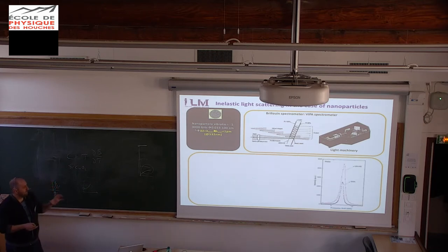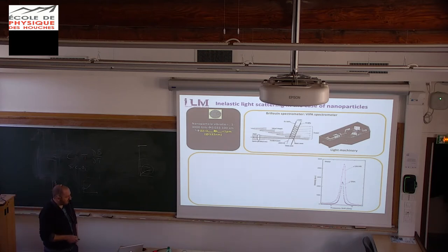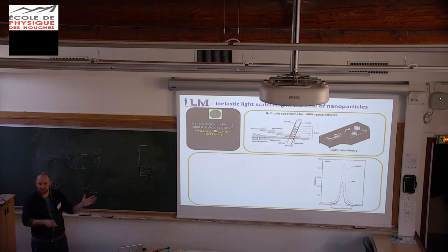But we organized a school in January in Lyon for BioBrillouin, and they brought their apparatus there, and we compared it to our tandem Fabry-Perot spectrometer. So I show you the spectra obtained. The smallest one is from the tandem. The biggest is from the Light Machinery system. So this is a Brillouin spectrum of water, its sound velocity.